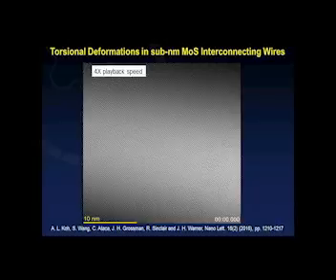Okay. Let me ask you one more question. How significant is the degradation in resolution by the membranes in gas cell holders?